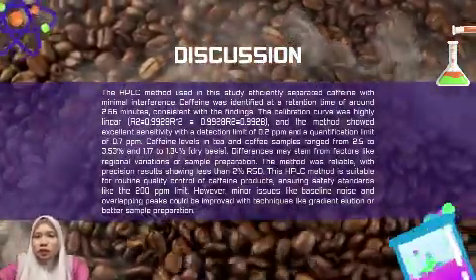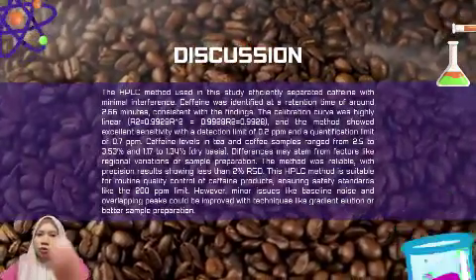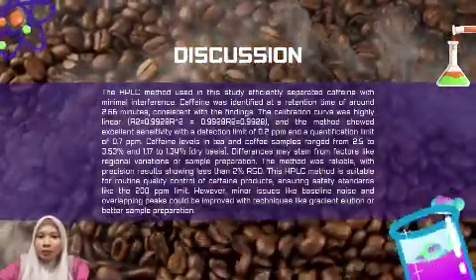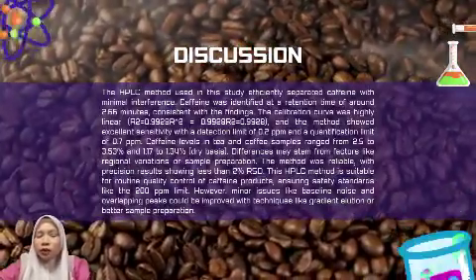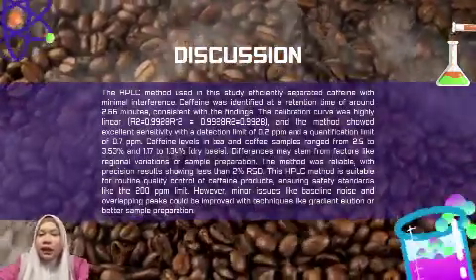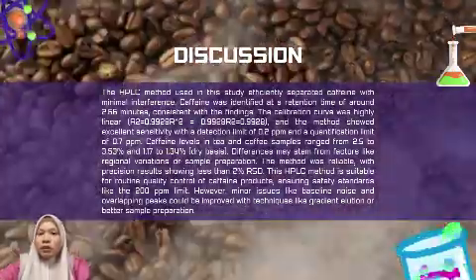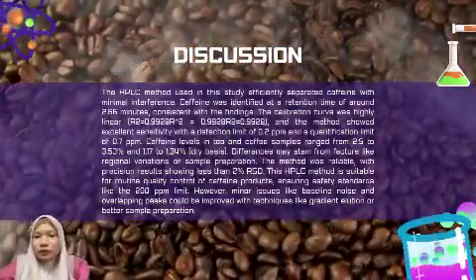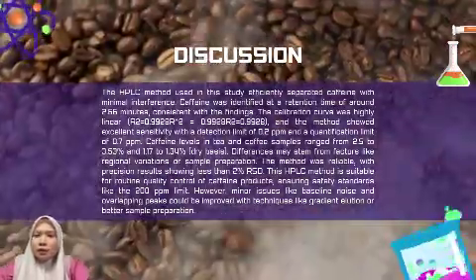The method was also very sensitive with a detection limit of 0.2 ppm and a quantification limit of 0.7 ppm. The caffeine level we measured in tea and coffee samples ranges from 2.5 to 3.53% for tea, and for coffee 1.17 to 1.34% based on dry weight. Variation we observe could be due to factors like regional differences or how the samples were prepared.